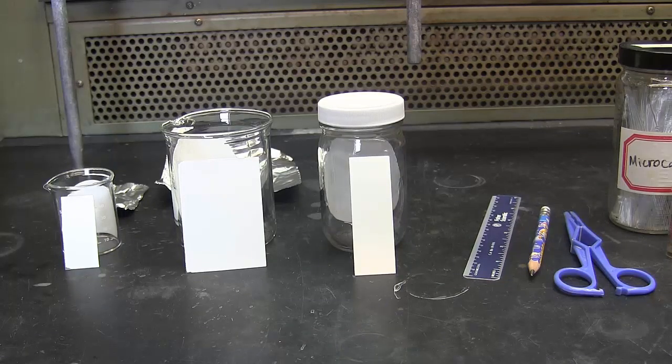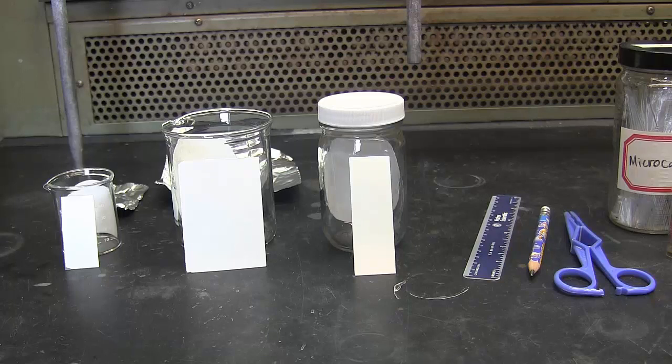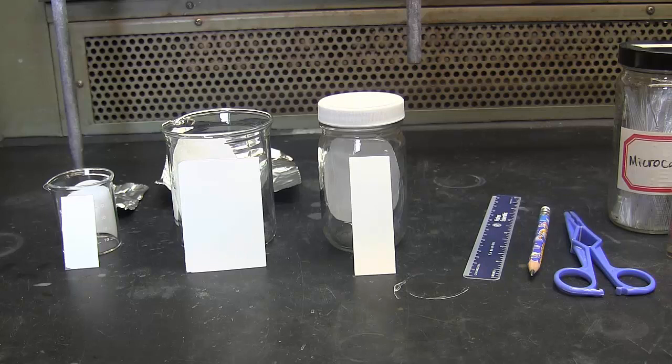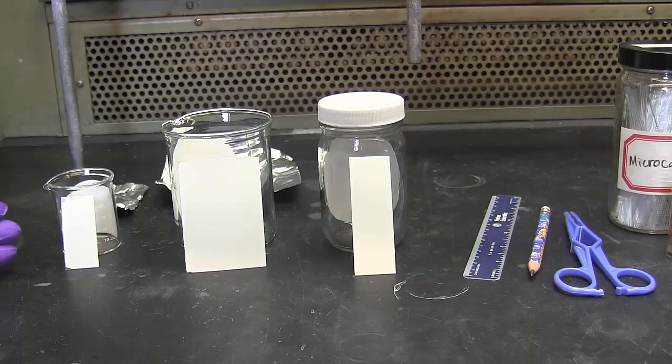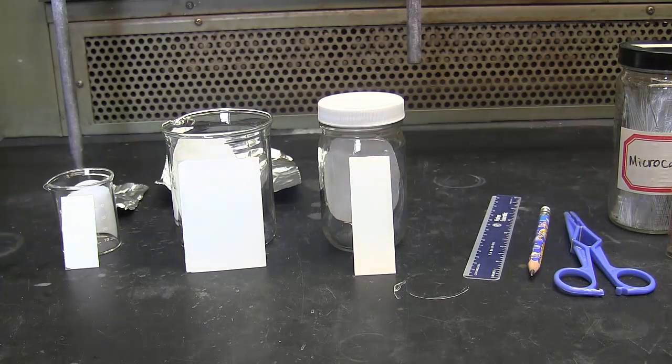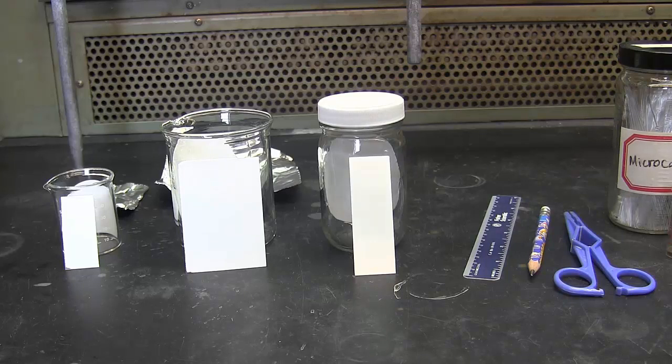You'll need to pick a developing chamber that matches the size of the TLC plate you're going to develop. On the far left, you'll see that I have a 50 milliliter beaker and a very small TLC plate. That would be appropriate for monitoring fractions coming off a column.